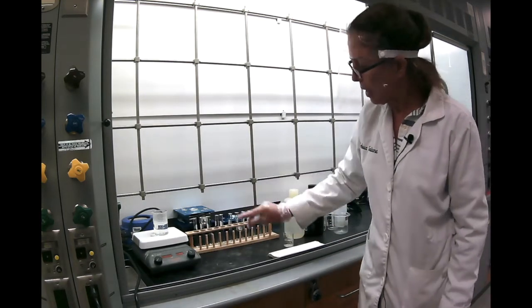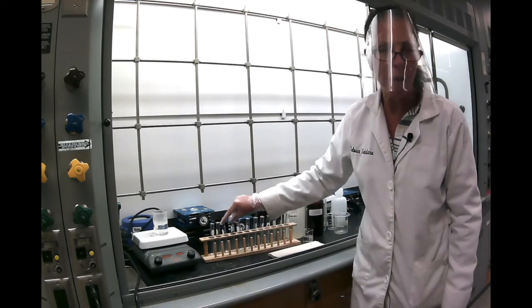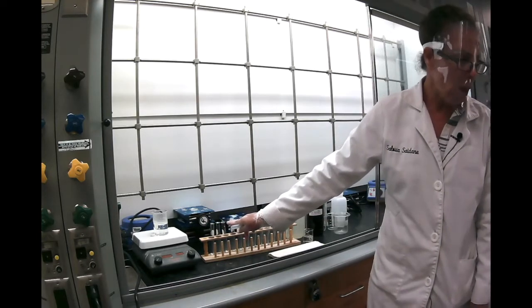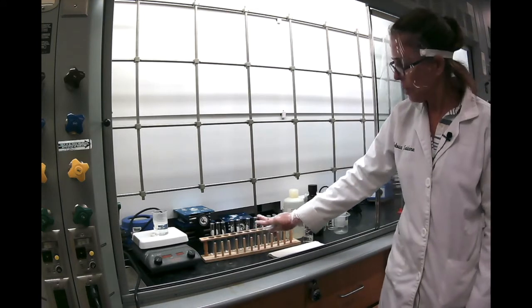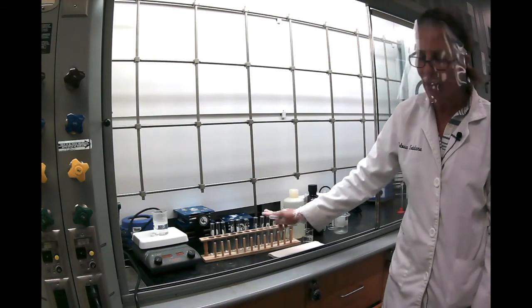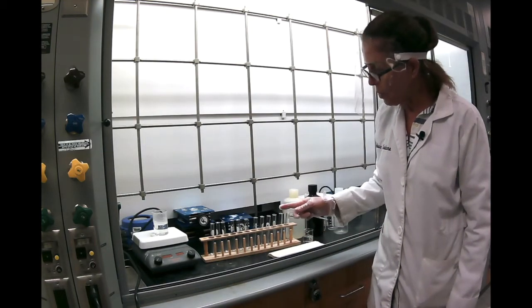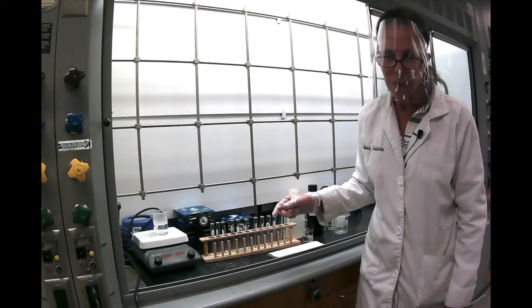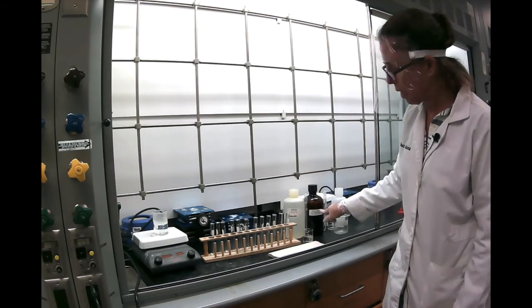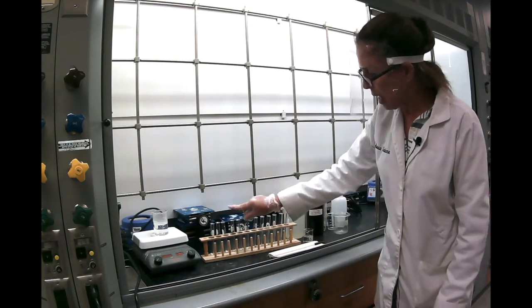While it was heating, I went ahead and measured 0.1 gram of each substance. The first three test tubes are resorcinol, the next three are naphthalene, this substance is benzoic acid, and the last three are acetanilide. We're going to see their solubility in water, in 95% ethanol, and in petroleum ether. To be consistent, I prepared them.